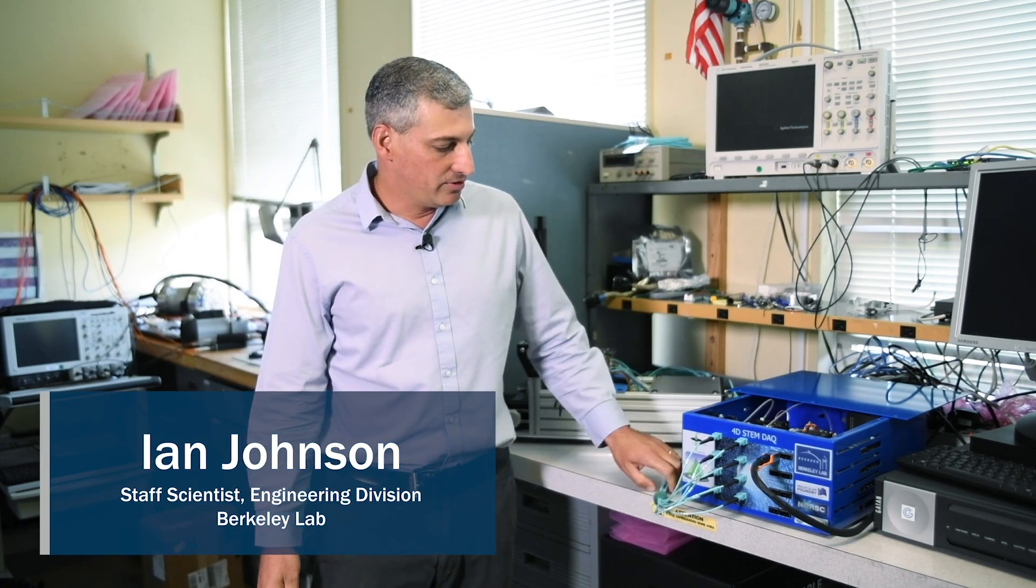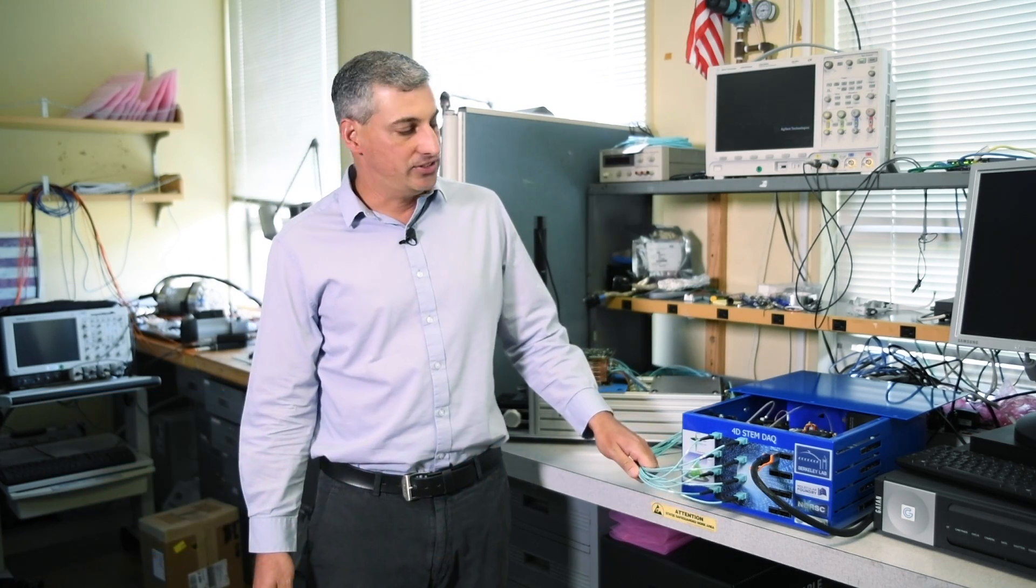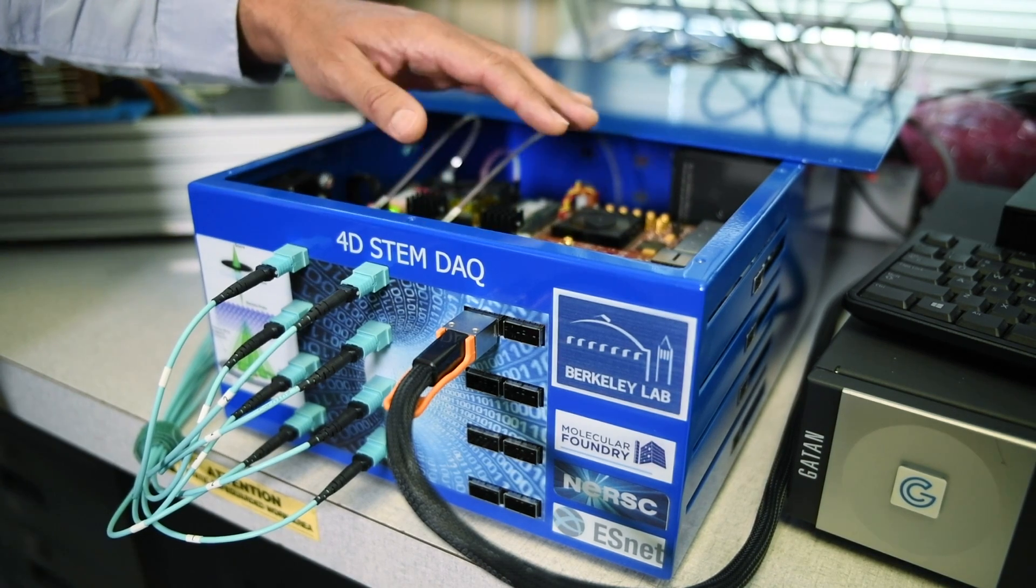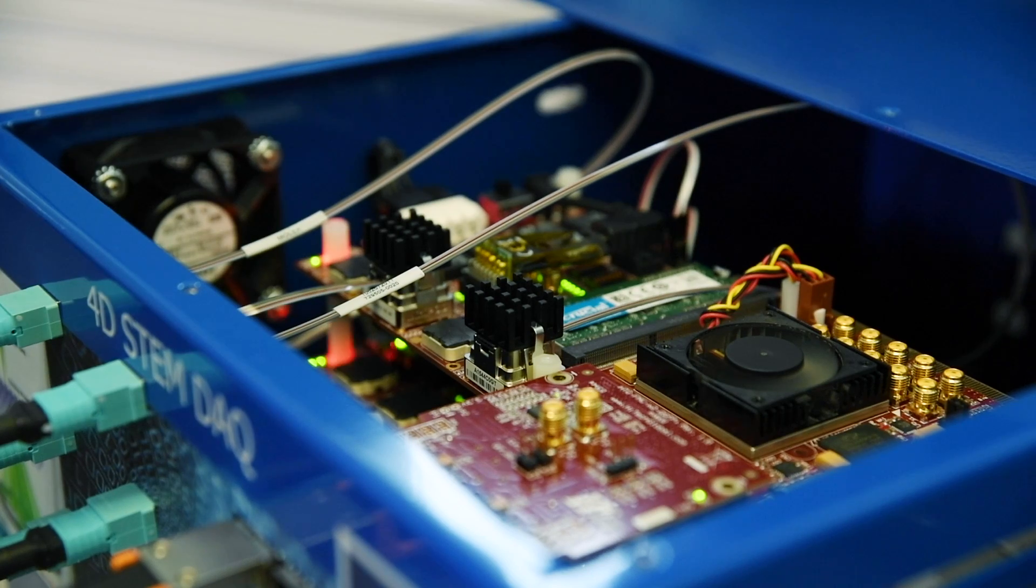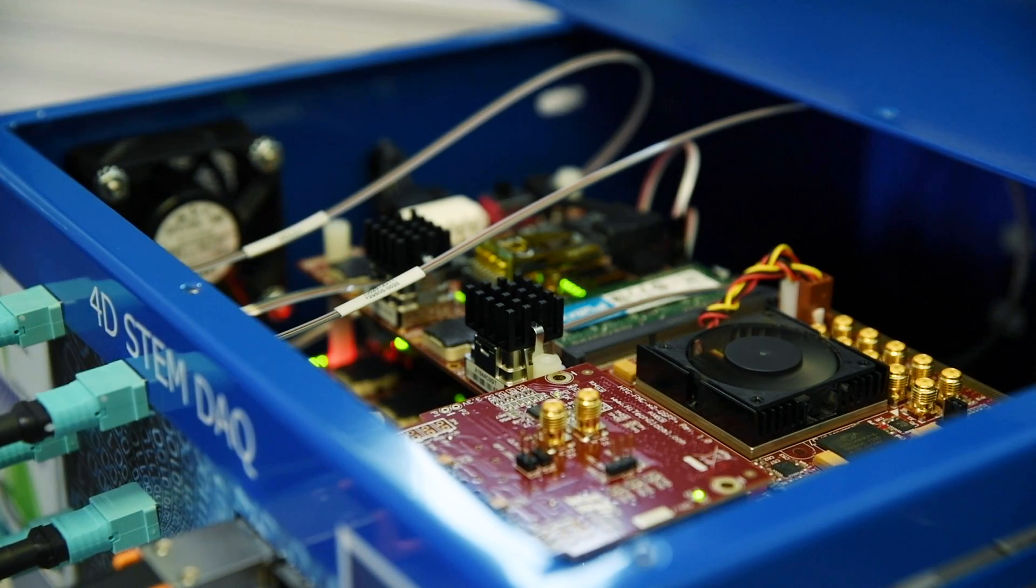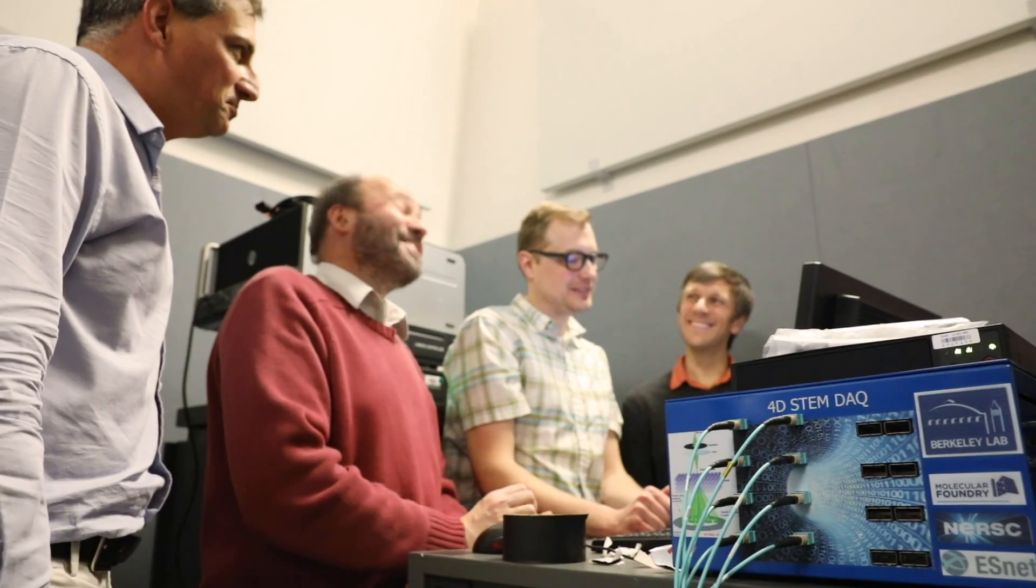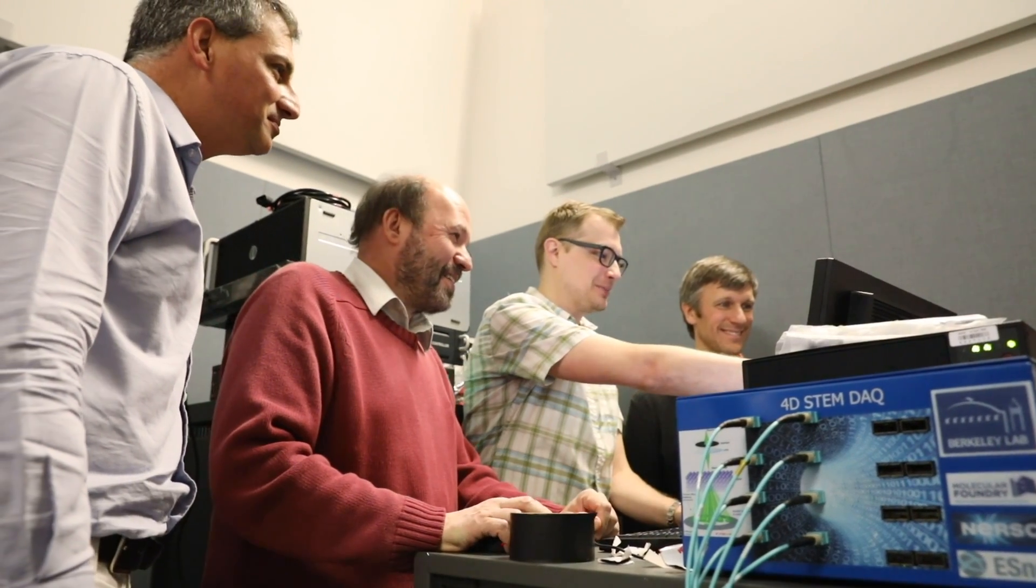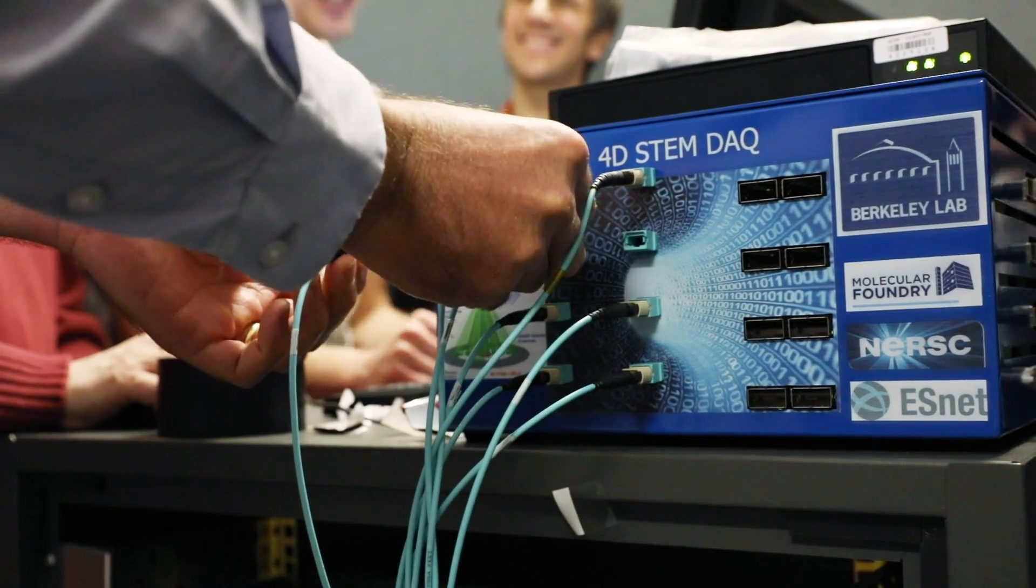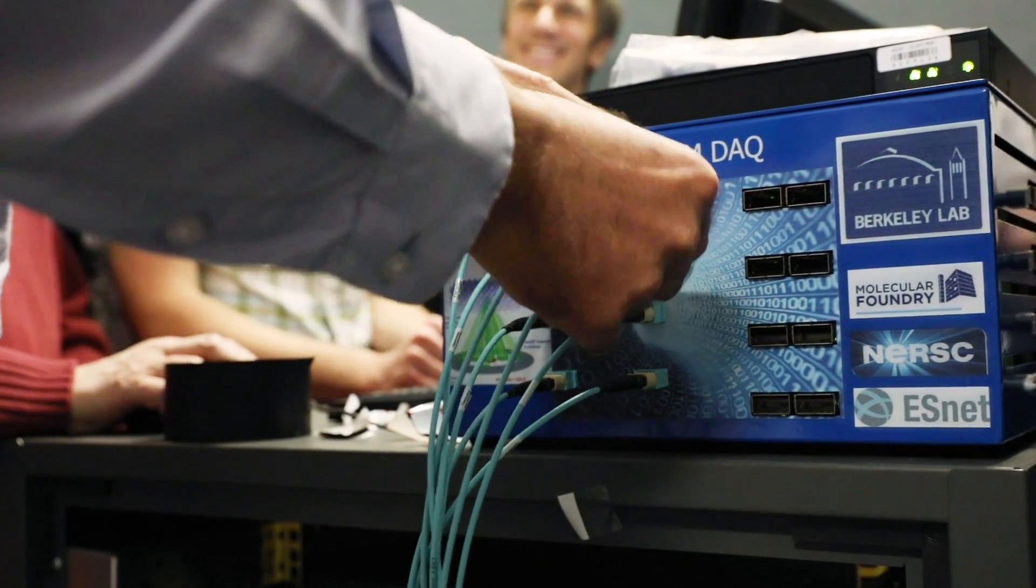The data is digitized in the camera and transferred over about 100 fiber optic connections to the data acquisition system. In the data acquisition system, the four field programmable gate arrays organize the data into images and transfer it onto the network. This detector will generate an enormous amount of data. It's equivalent to watching about 60,000 HD movies simultaneously.